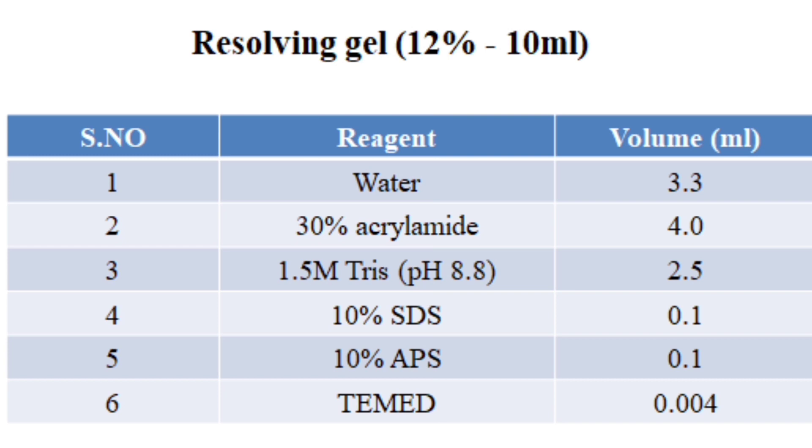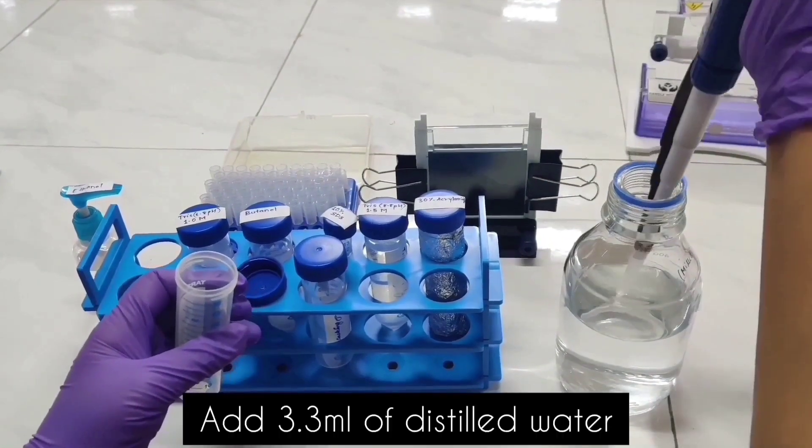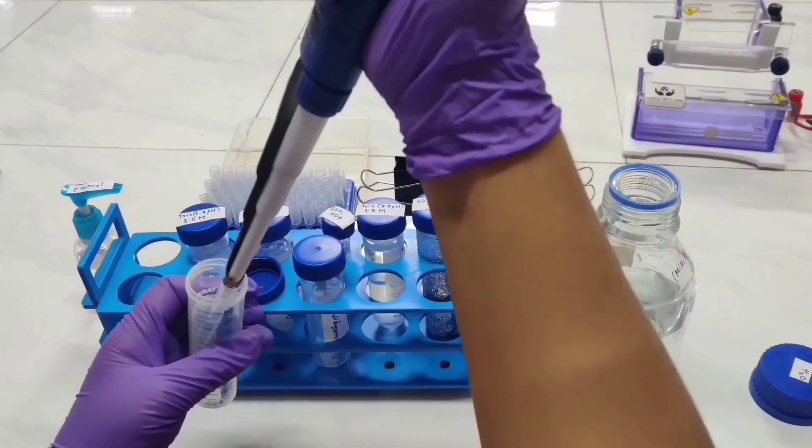Let's see how to prepare the separating gel. To prepare the resolving gel, we need water, 30% acrylamide, 1.5 molar tris with a pH of 8.8, 10% SDS, 10% APS, and TEMED. After adding each component, we have to ensure to mix the components thoroughly.